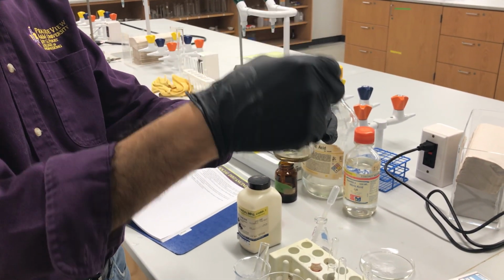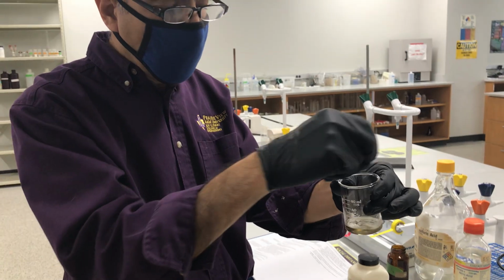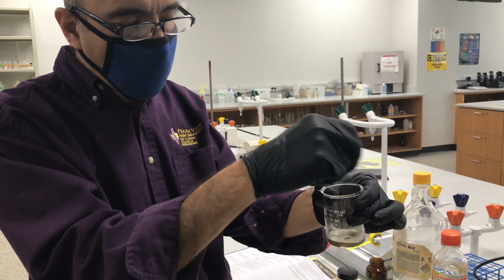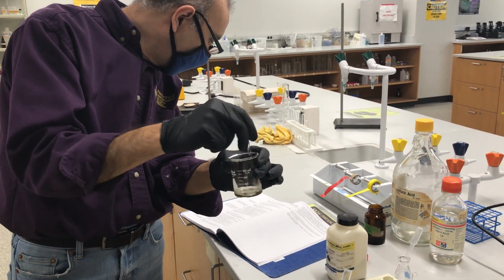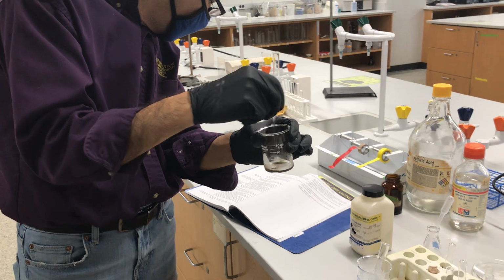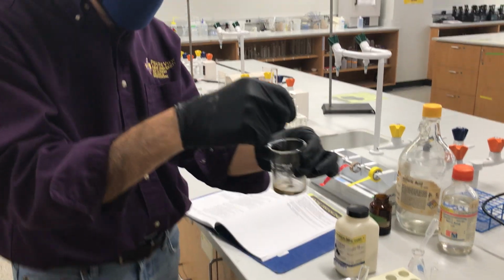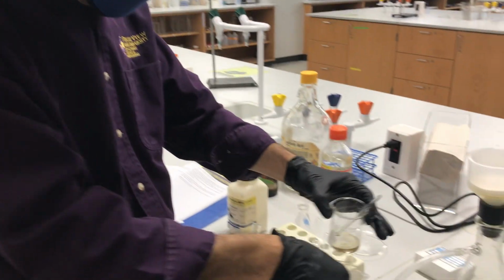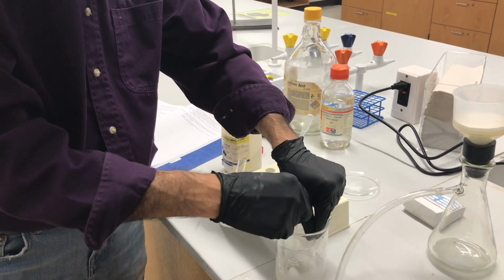Now I don't need the ice bath, so I'll just stir this a little bit. I will leave the compound to make sure it reacts, and let's see how long it will take. So basically, guys, this is going to take about half an hour. Okay. So I'm going to stop right now, and I will come back after half an hour.